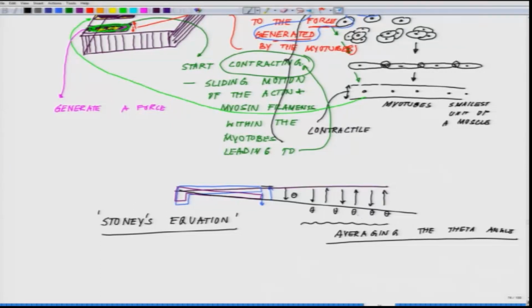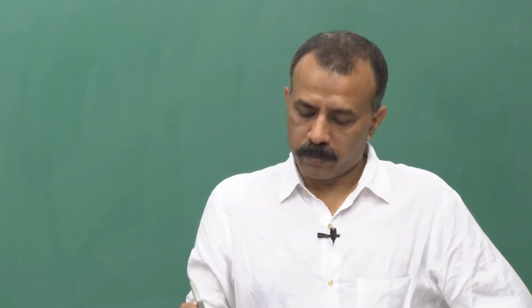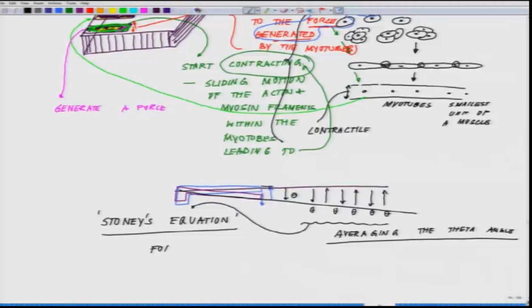You can feed this value of theta into Stoney's equation, and you can essentially measure the force generated by the myotube, and this force you can back calculate.